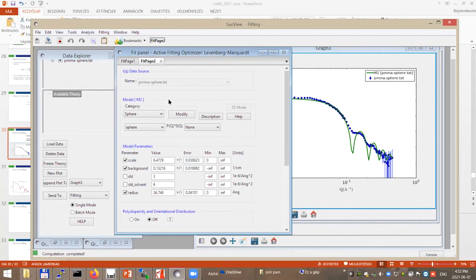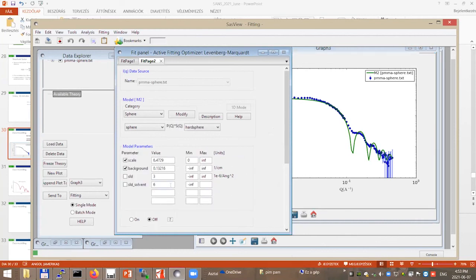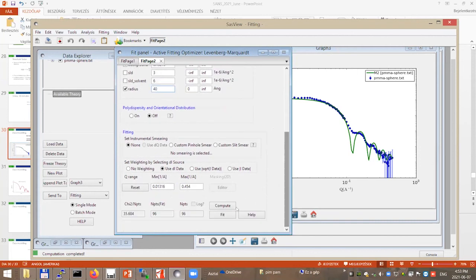If we, for example, put here 40, and compute, then you will see that the picture moves a little bit. So it went a little bit to the left. So imagine that there are 40, there are some which are 35, and they move a little bit right. So the minima will not be in the same places, the maxima not in the same places, so everything will be added up, and finally it leads to a smearing like that.